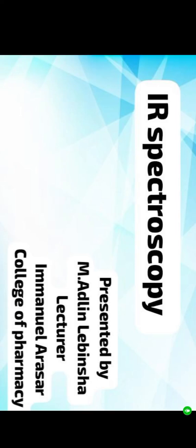Welcome students. Today we will learn about IR spectroscopy. This is one of the absorption type or molecular vibration spectroscopies.